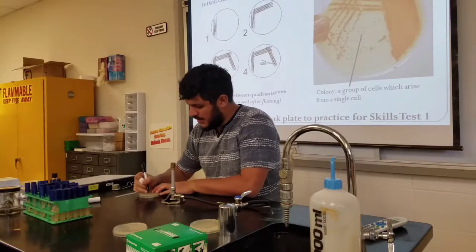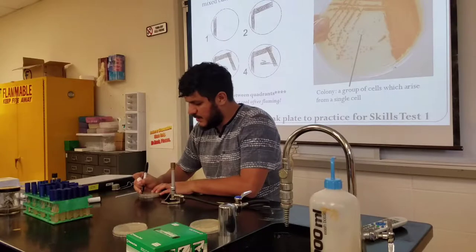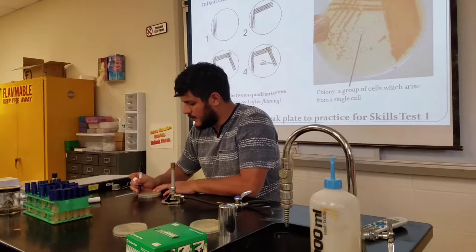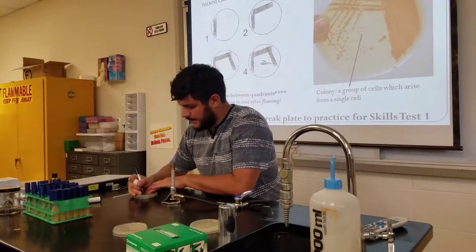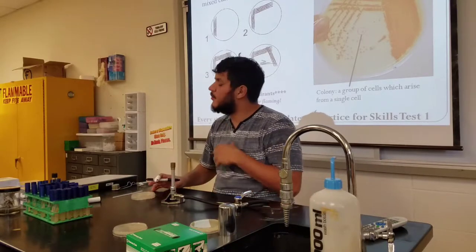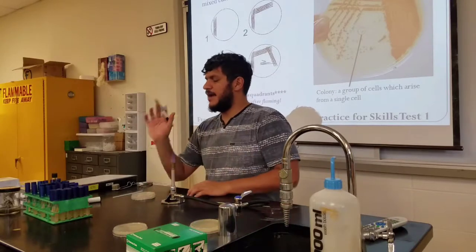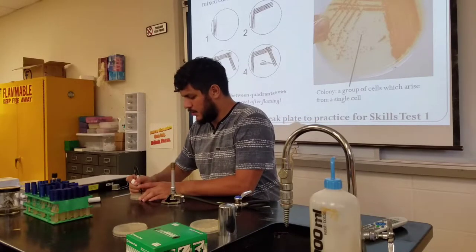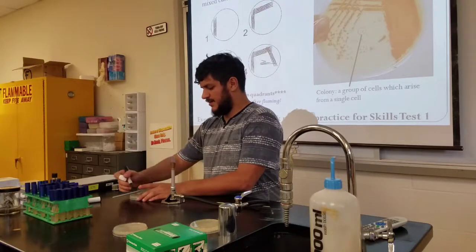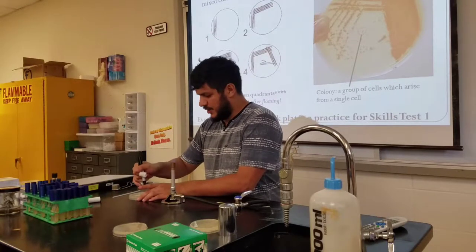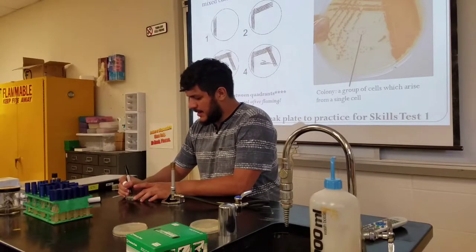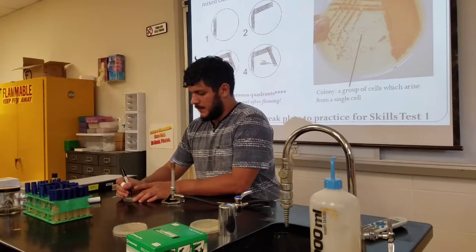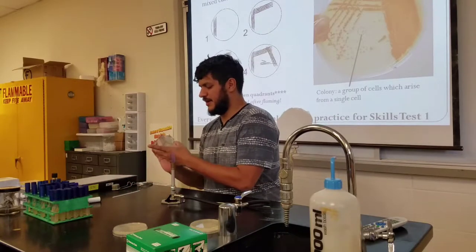I'm going to write my complete info: 12-31-107, my date which is September 14, 2017, and my initials. In this case, because we have three separate species of bacteria on this plate, I'm going to draw lines to split the plate into three spaces, and on each space I'll label which species of bacteria I'm going to use to recognize where that bacteria is.